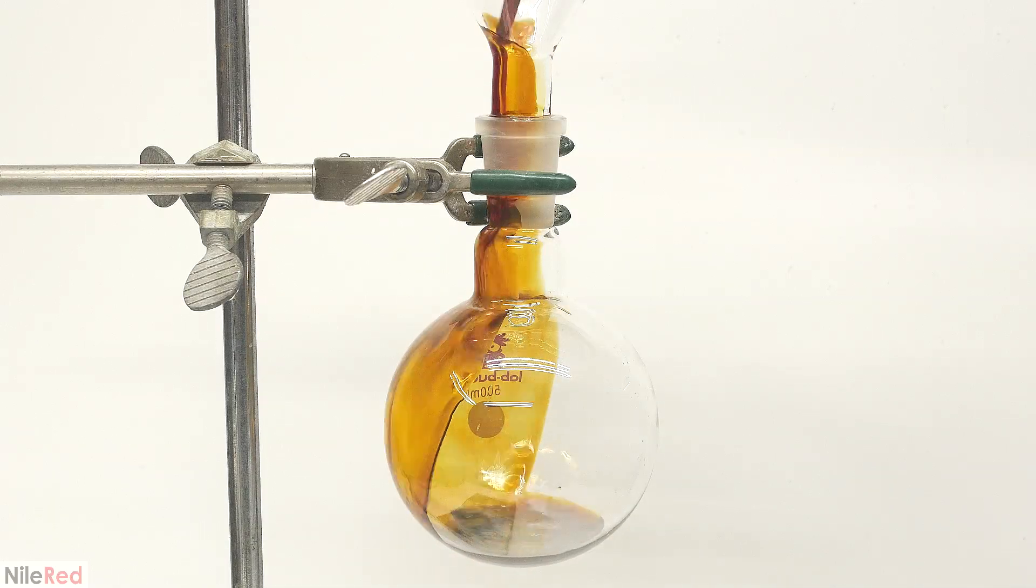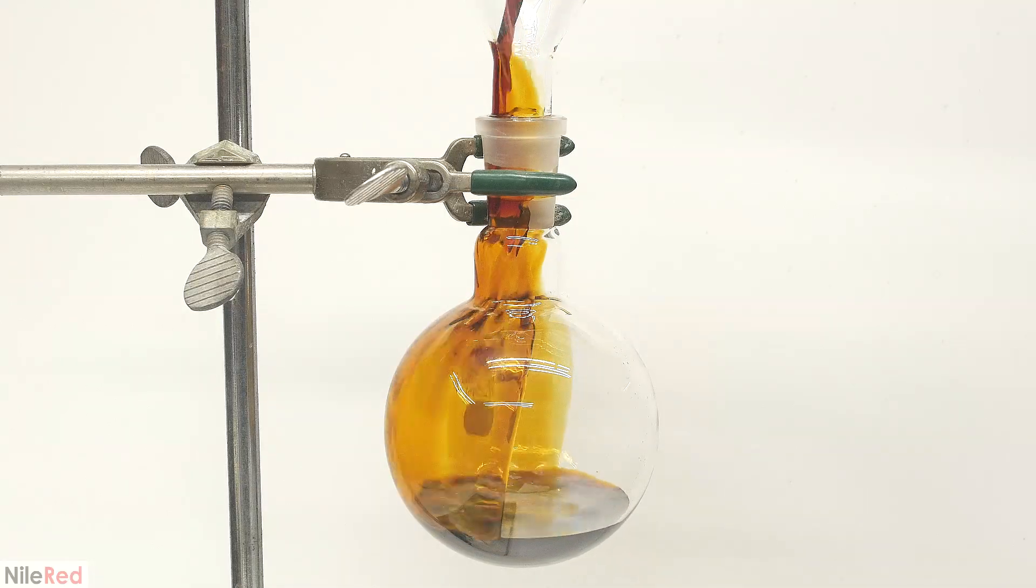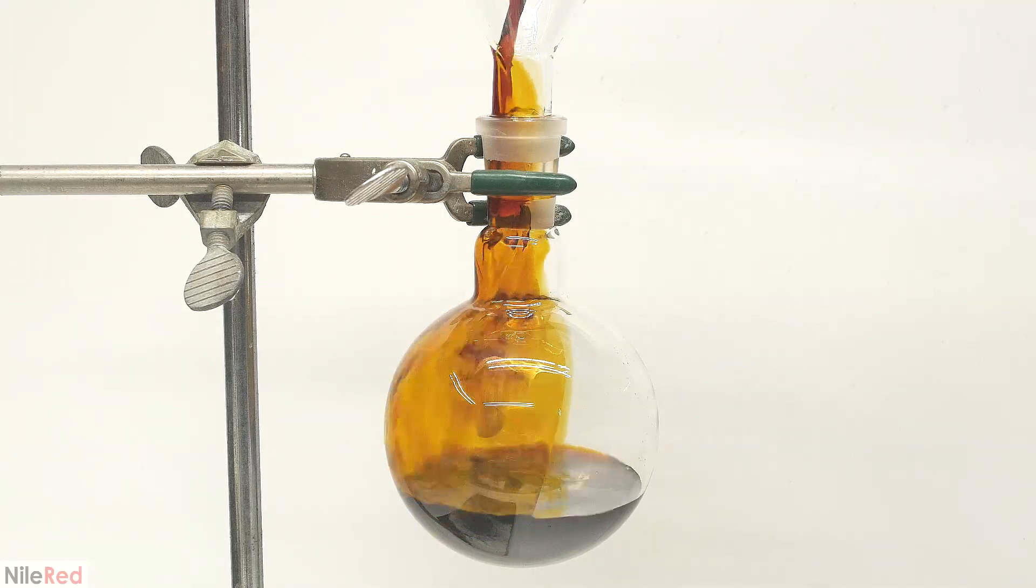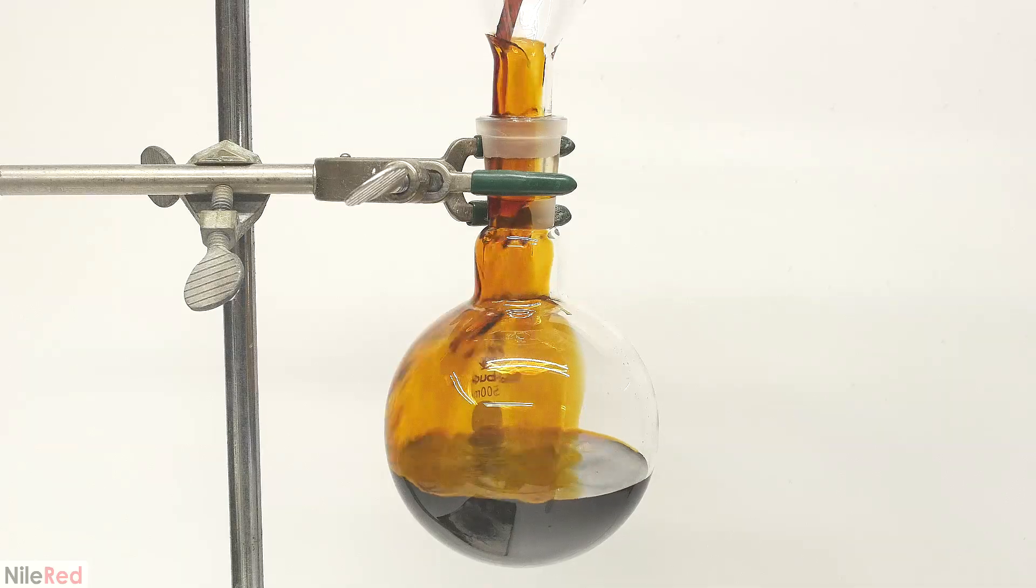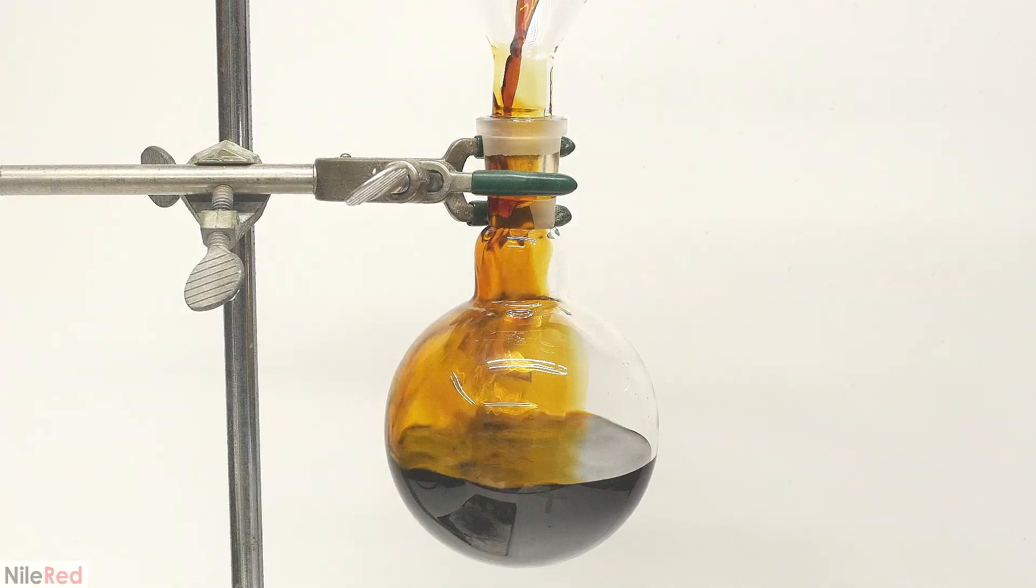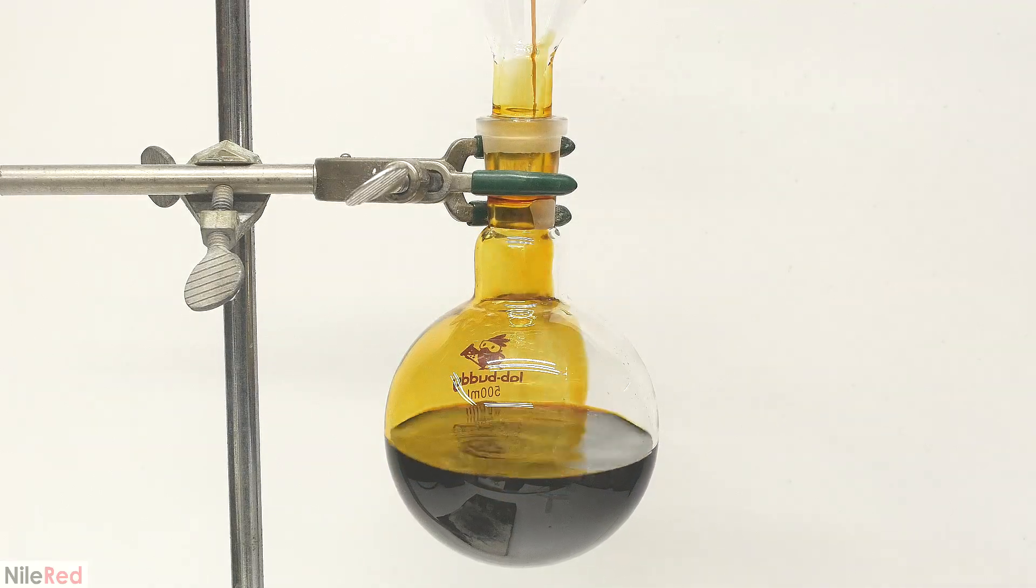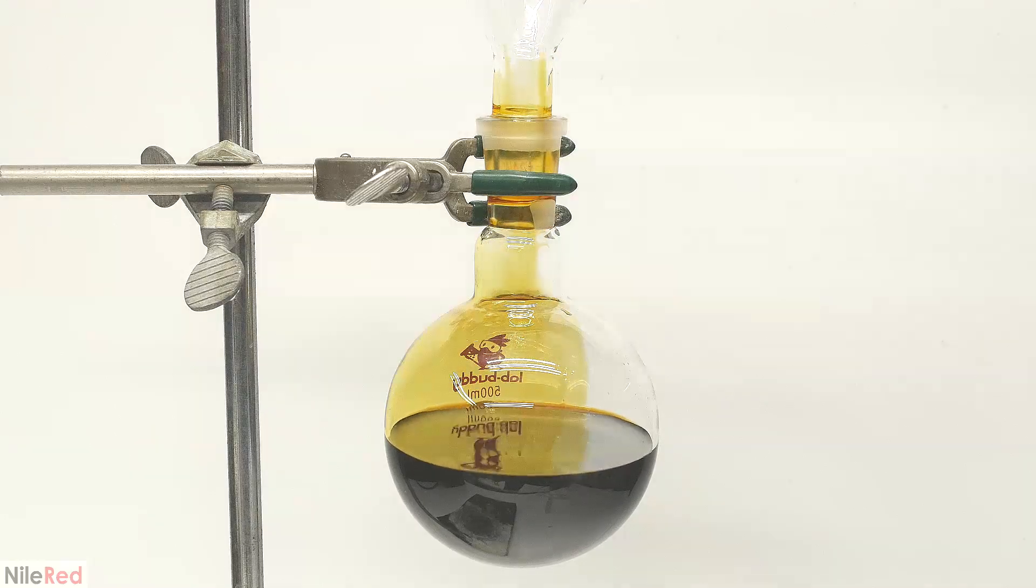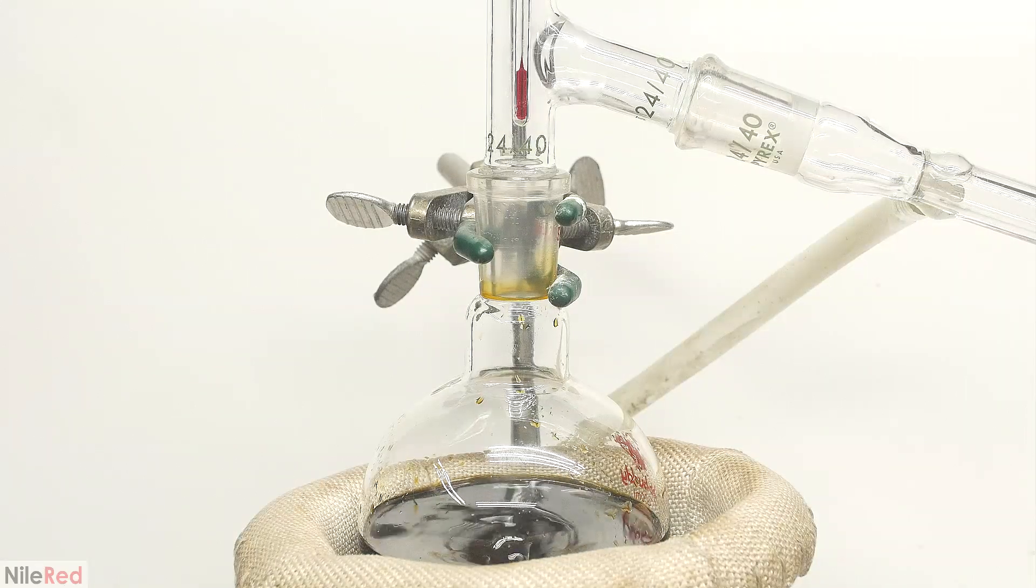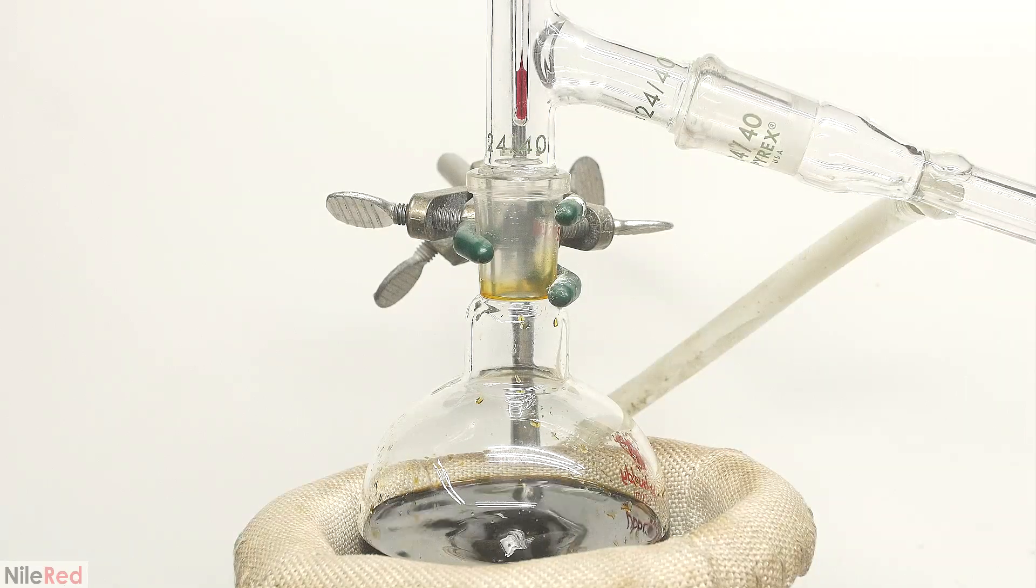To do this, it's pretty simple. I just pour everything into a large round bottom flask, and then I carry out a vacuum distillation. It's not absolutely necessary to do it under vacuum, but because aniline degrades in the presence of oxygen, it just makes things a little bit cleaner.